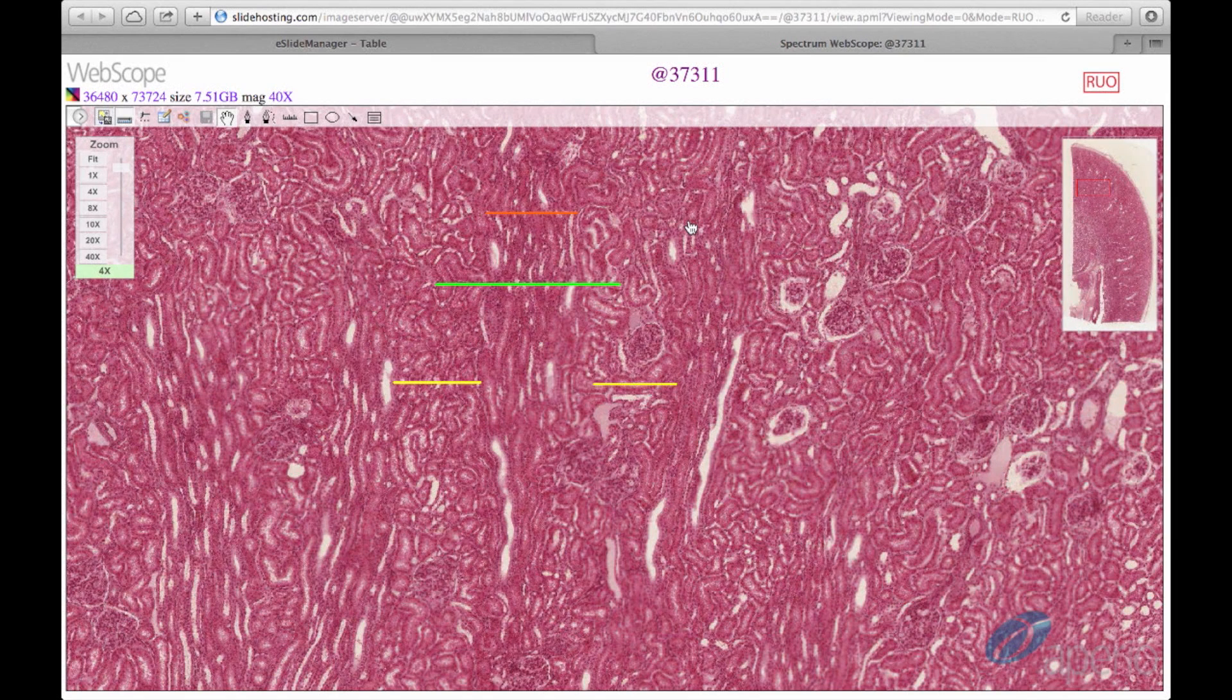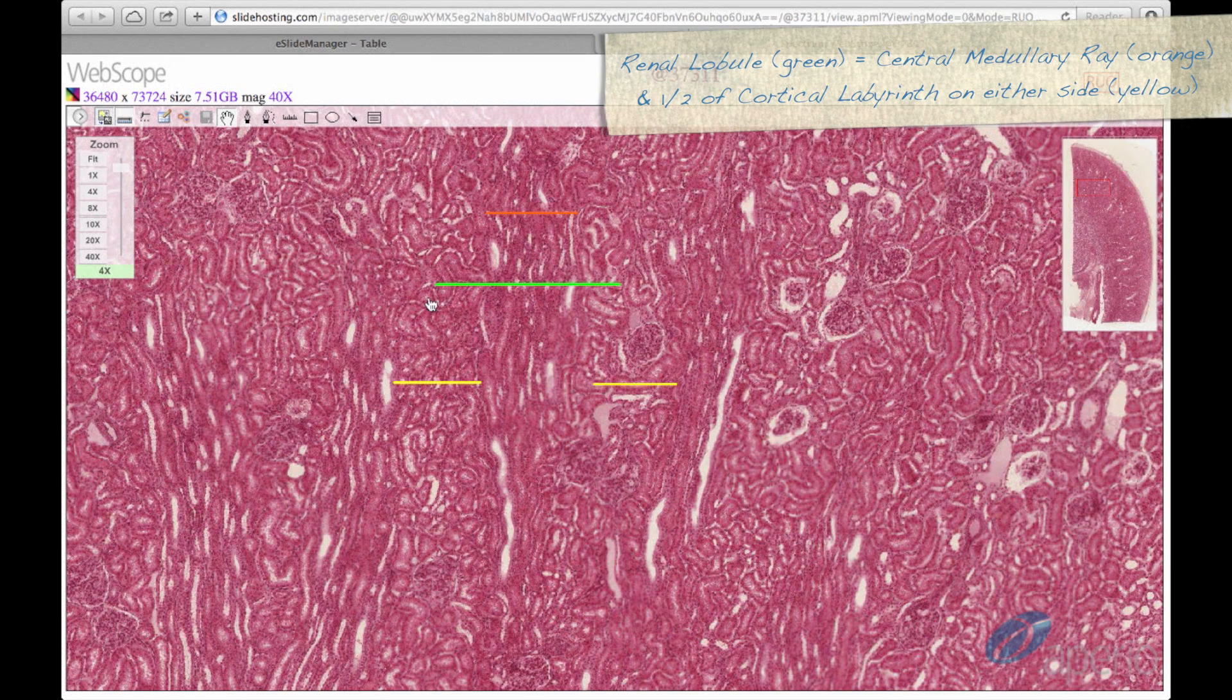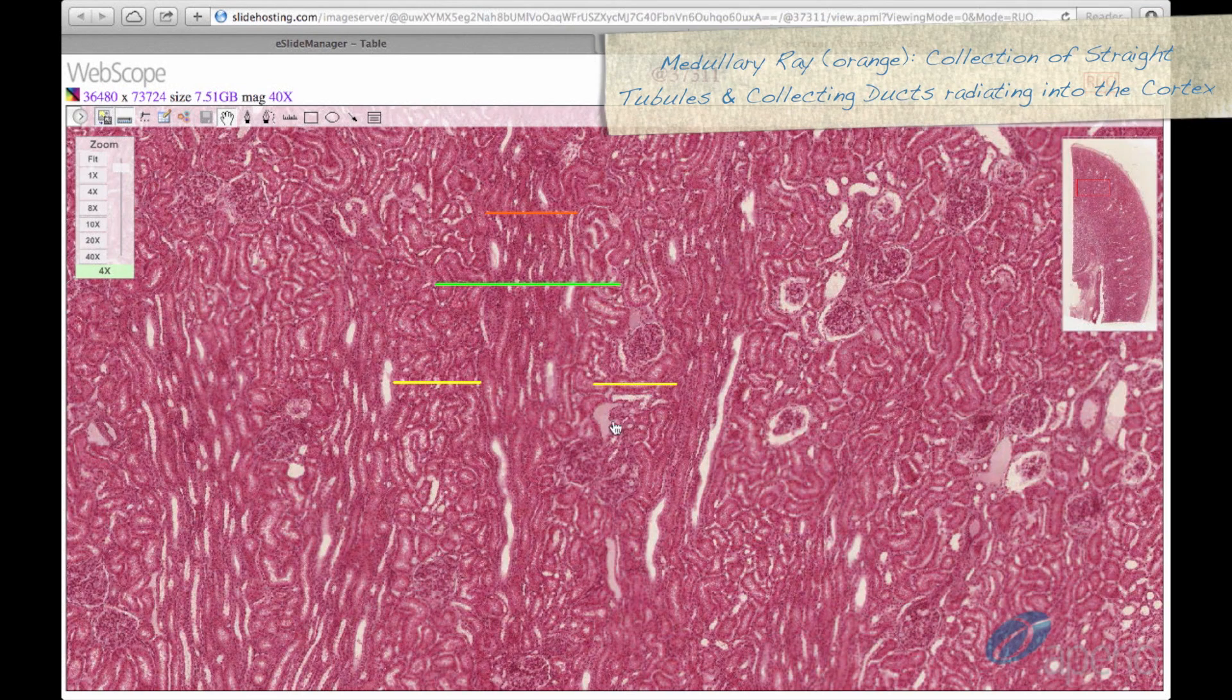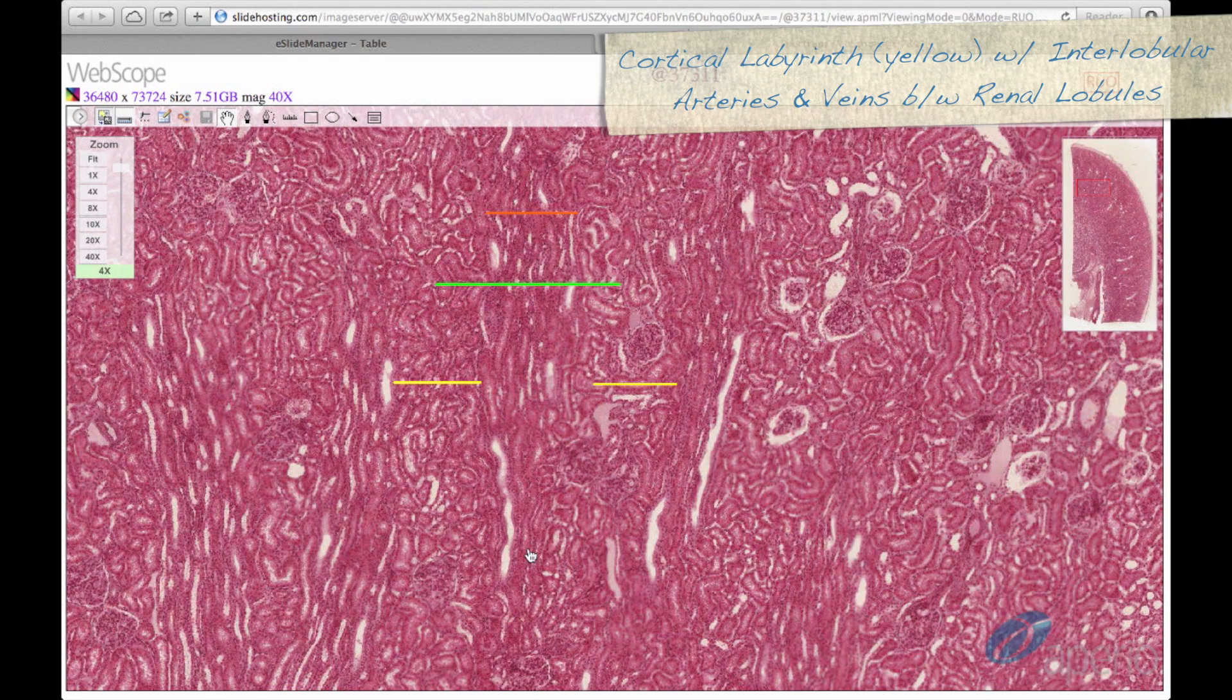We have zoomed in on a different section of the slide so we can identify the renal lobule, seen here spanned by the green line. The renal lobule is composed of a central medullary ray and one half of the cortical labyrinth on either side. The medullary ray is a collection of straight tubules and collecting ducts radiating into the cortex. It is seen here spanned by the orange line. The cortical material, or labyrinth, is divided equally between two adjacent renal lobules and can be seen here spanned by the yellow lines.